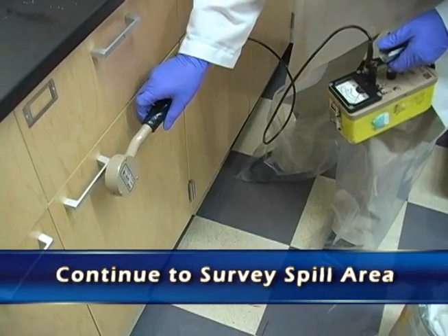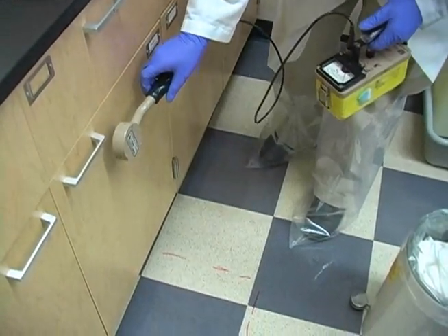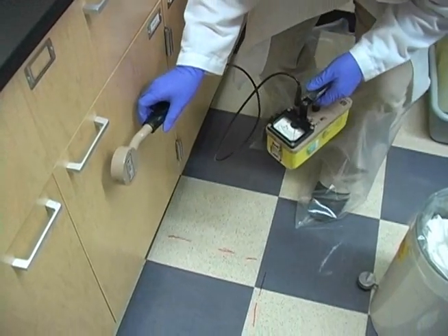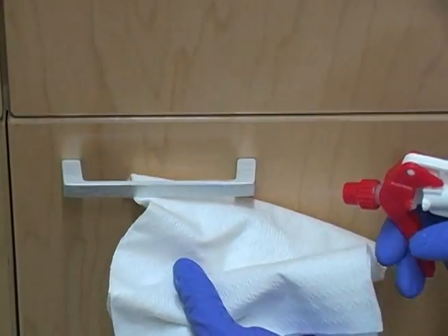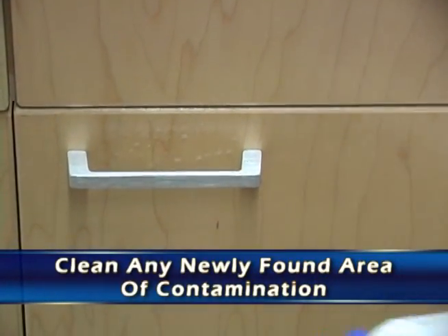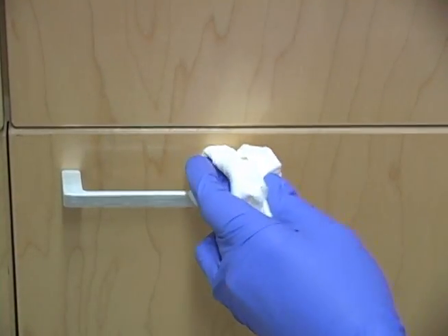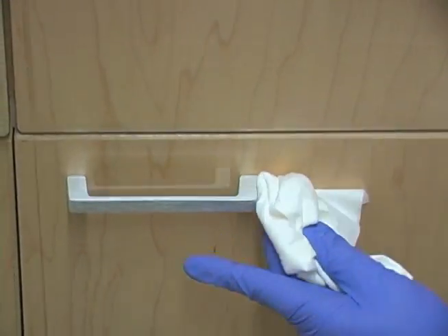Continue to survey the whole spill area, as there may be other areas you didn't realize got contaminated — there may have been a few drops down the front of the cabinets or on the handle. So if you find a new area of contamination, clean it up the same way and then re-survey.